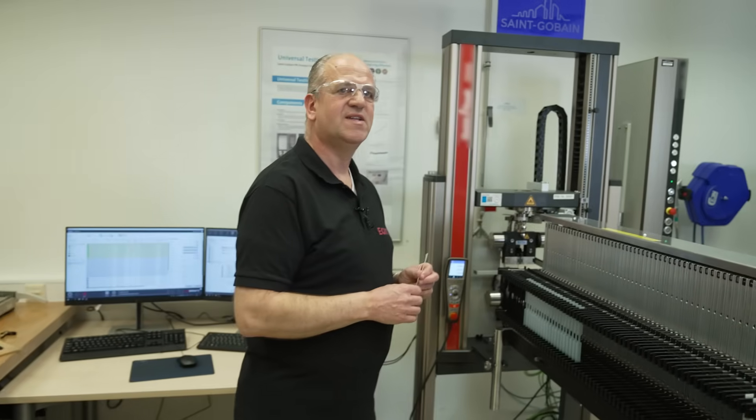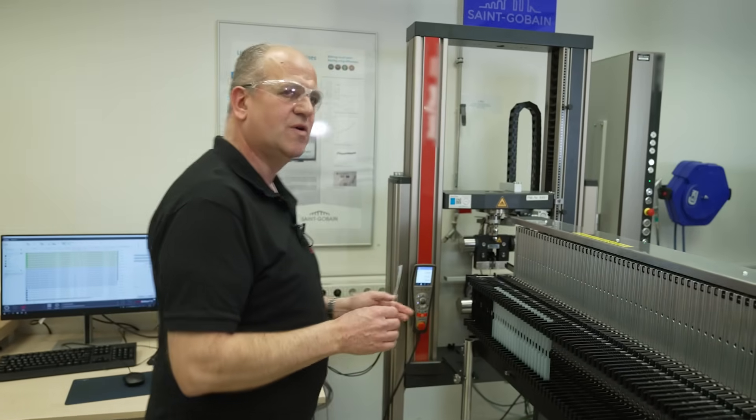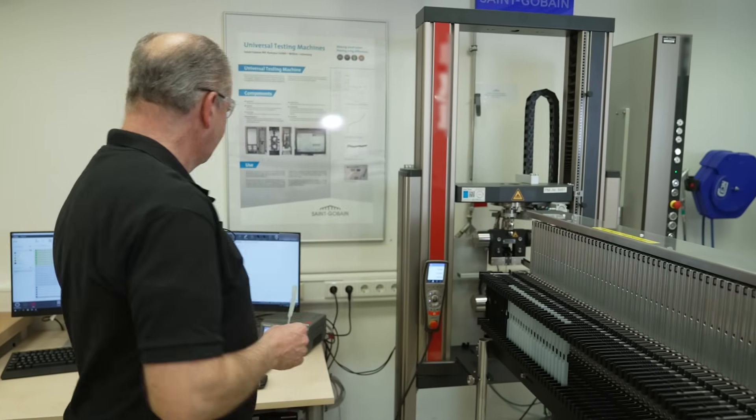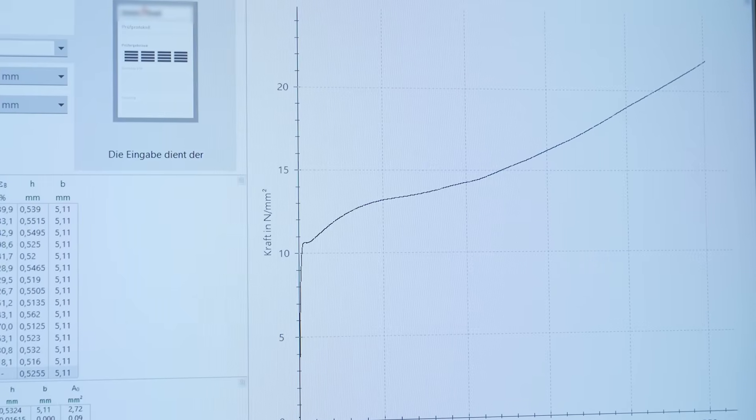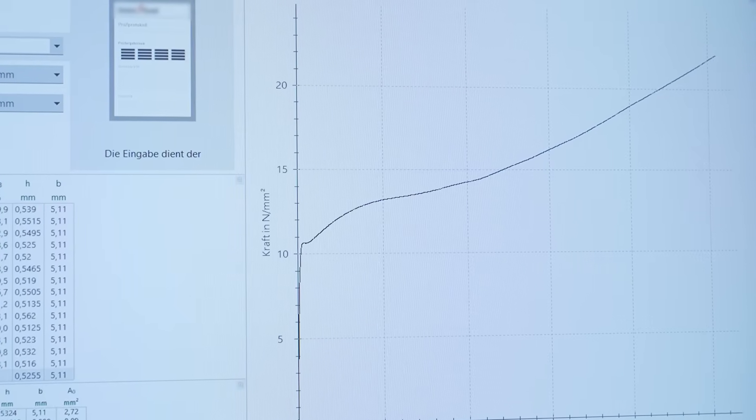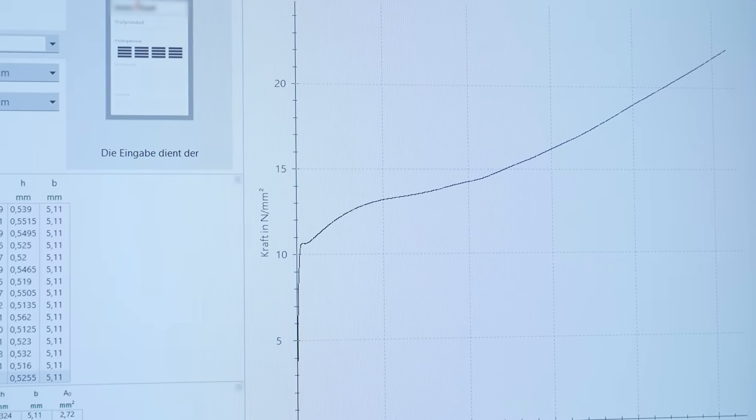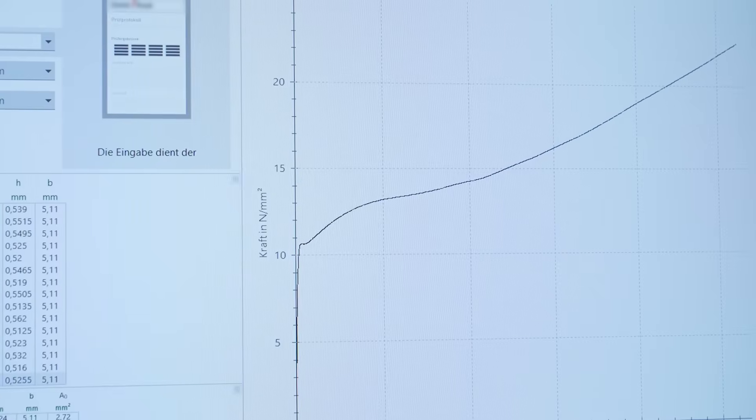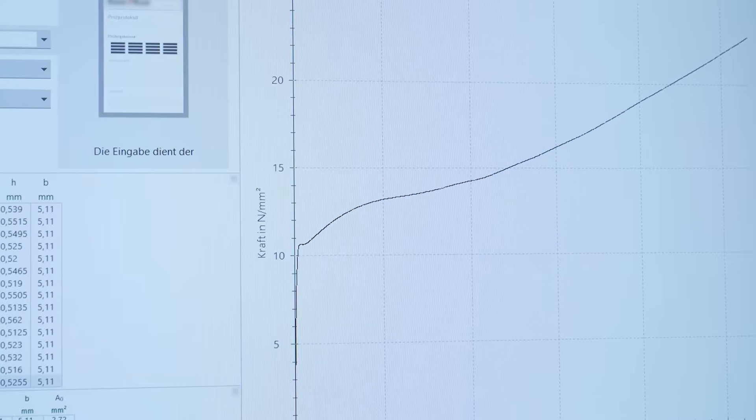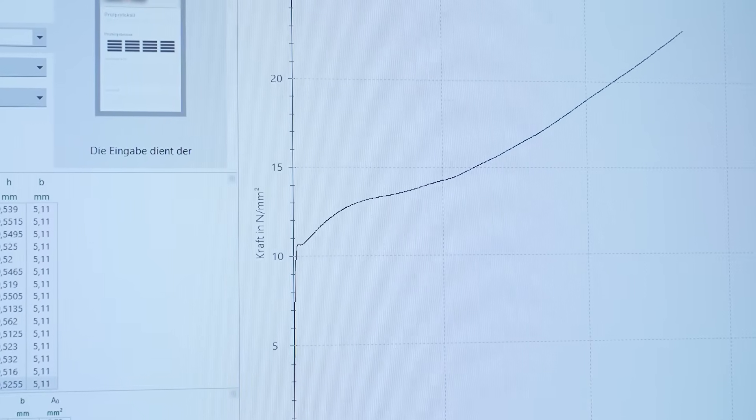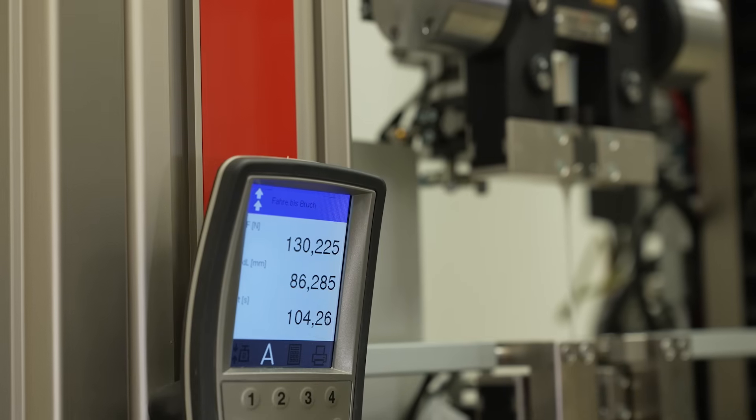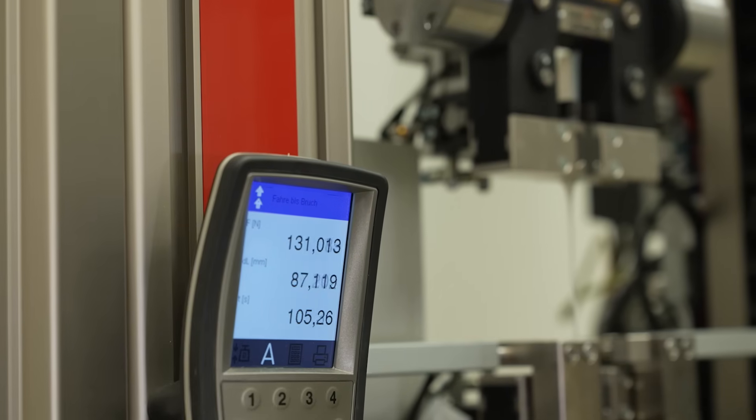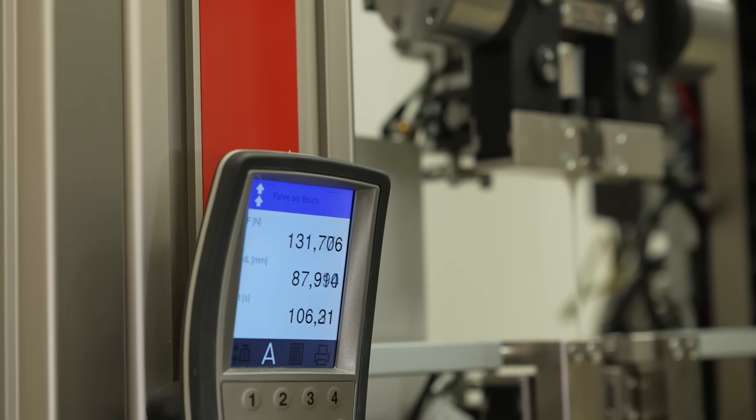All the data is stored into the computer. You see the tensile curve here, and this data is also directly transferred to our SAP system.